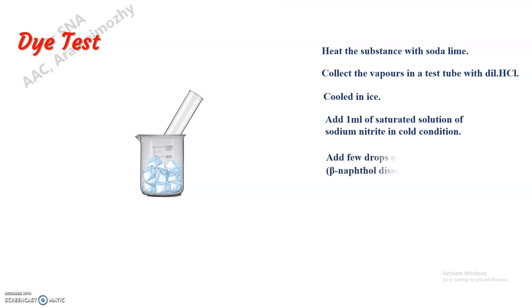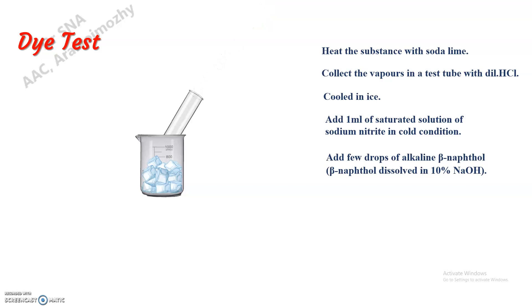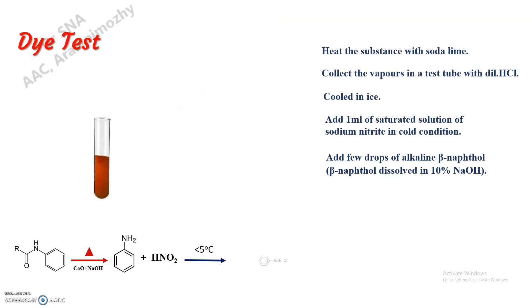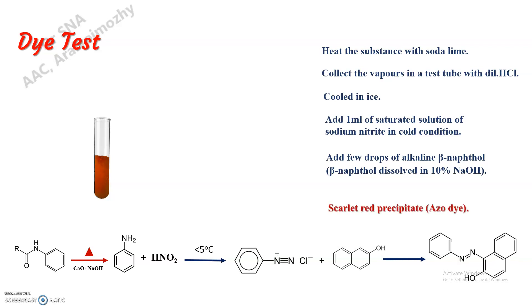After this, we have to add a few drops of alkaline beta-naphthol solution, also in ice cold condition. We can see here the formation of scarlet red dye — that is, the azo dye will be formed here. This indicates the presence of the anilide group.